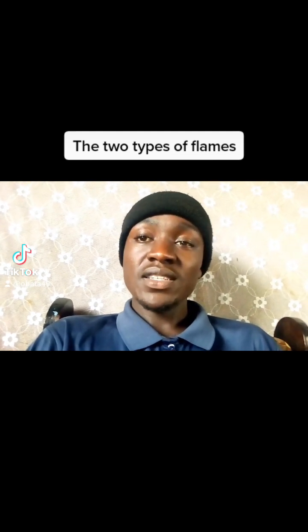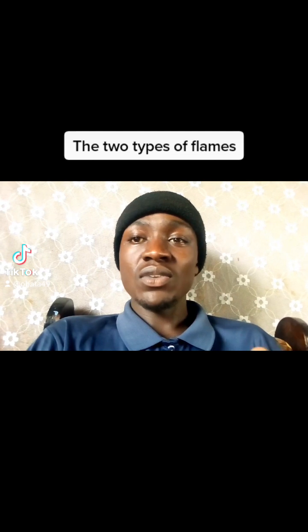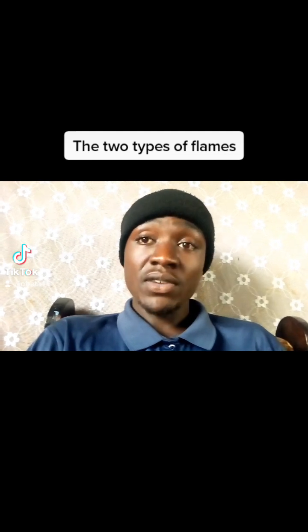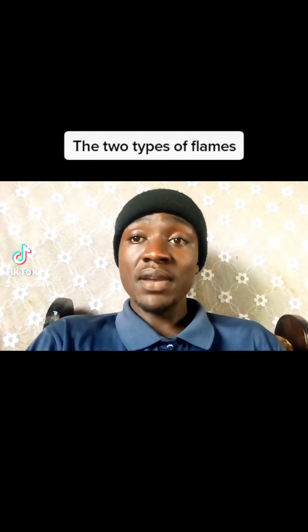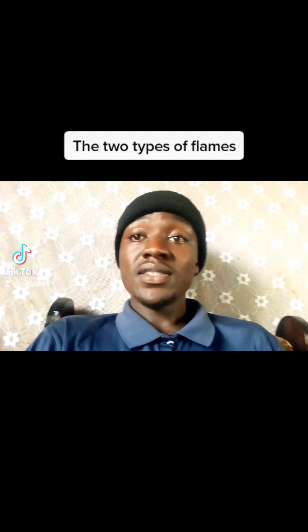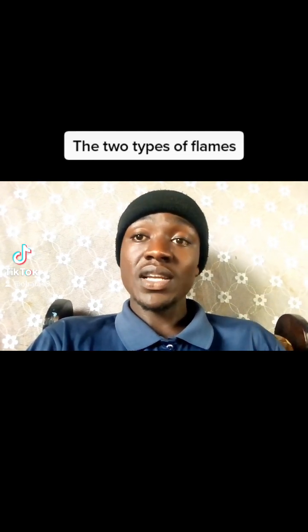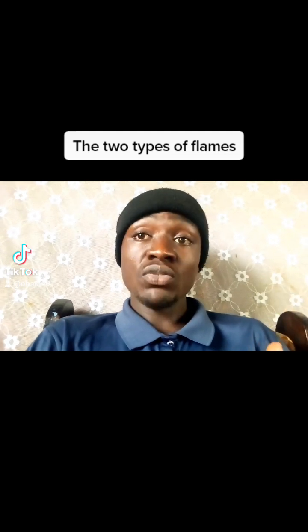Now, under this, you should also know the differences between the two flames. I'll just highlight a few. For instance, the luminous one is large and wavy, non-luminous is small and steady. Luminous is bright yellow in color, non-luminous is pale blue in color. Luminous has 4 zones or 4 layers. Non-luminous has 3 layers. You should be in a position, by the way, to name those layers.